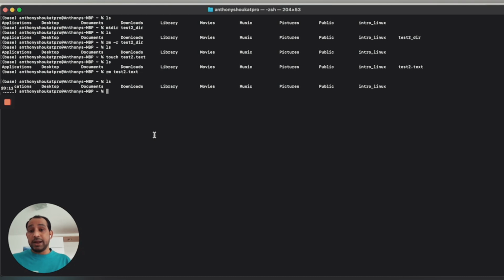So this is how you can make directories, go around the directories, remove directories, move directories, and you can also use wildcard even for removing and copying. This is a very fascinating system where you don't have to go into the folder; you stay in your command line terminal and you can remove, create, move, and copy files and folders. This is a very powerful thing.